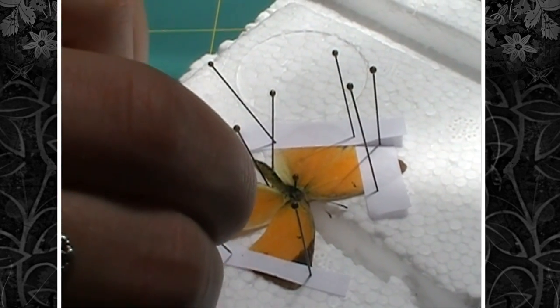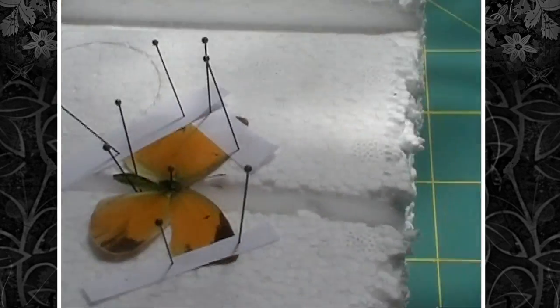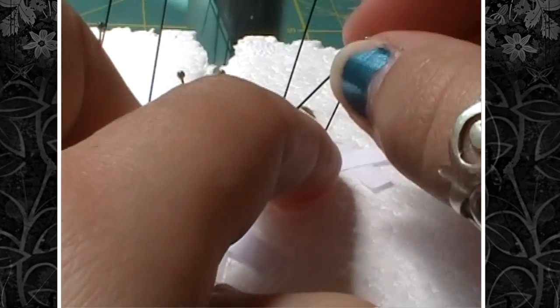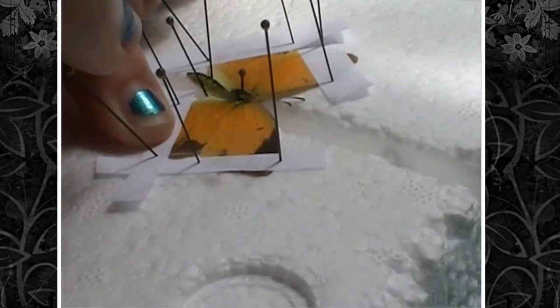This little piece of paper is a bit too long, so I pushed it to the side. Then do the same thing with the other wing — take a little piece of paper, pin above the wing, and pin below the wing.